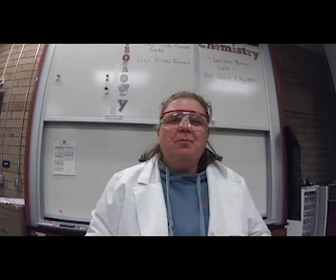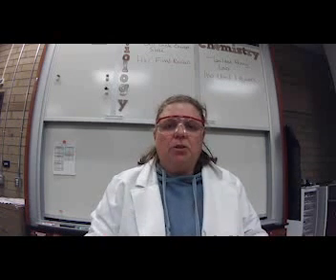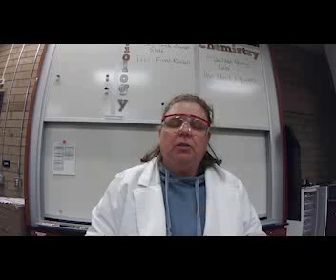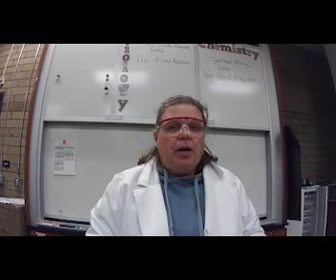Welcome to our metallic bonds lab. So we have 8 different samples here, and I'll be showing you the periodic table and where they're kind of located. But if you have yours in your notebook, go ahead and open it up. All right, we're going to look at different properties of metallic bonds.